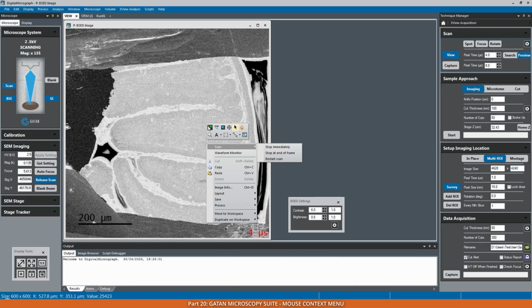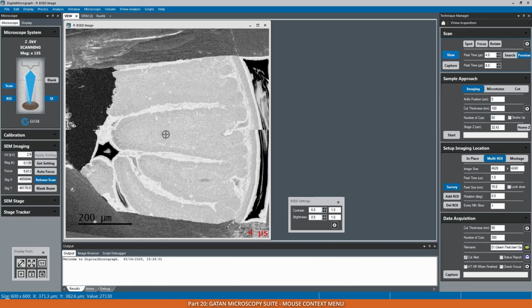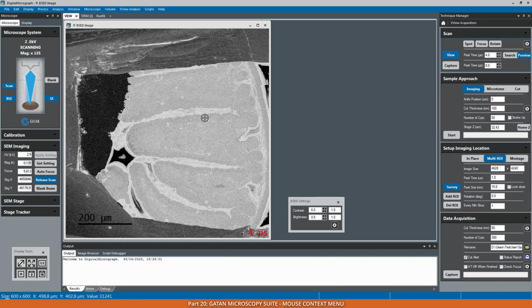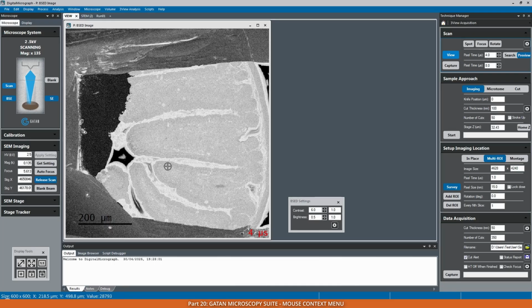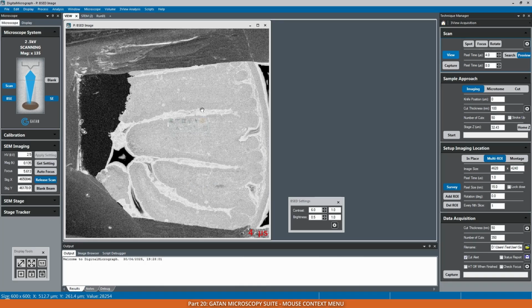Here at the top, there are other things. I do not remember actually all of them. I can tell you which ones I used. I used this one with the cross. This allows us to navigate around, so I can click at any place within the block, and then the stage will be moved so that the point is in the center of the view. Then this one is just a standard picking tool. I can select this arrow, the scale bar, and press the delete button to remove it. This is the pen or drag. It's basically if you have an image collected, then you can pan around.